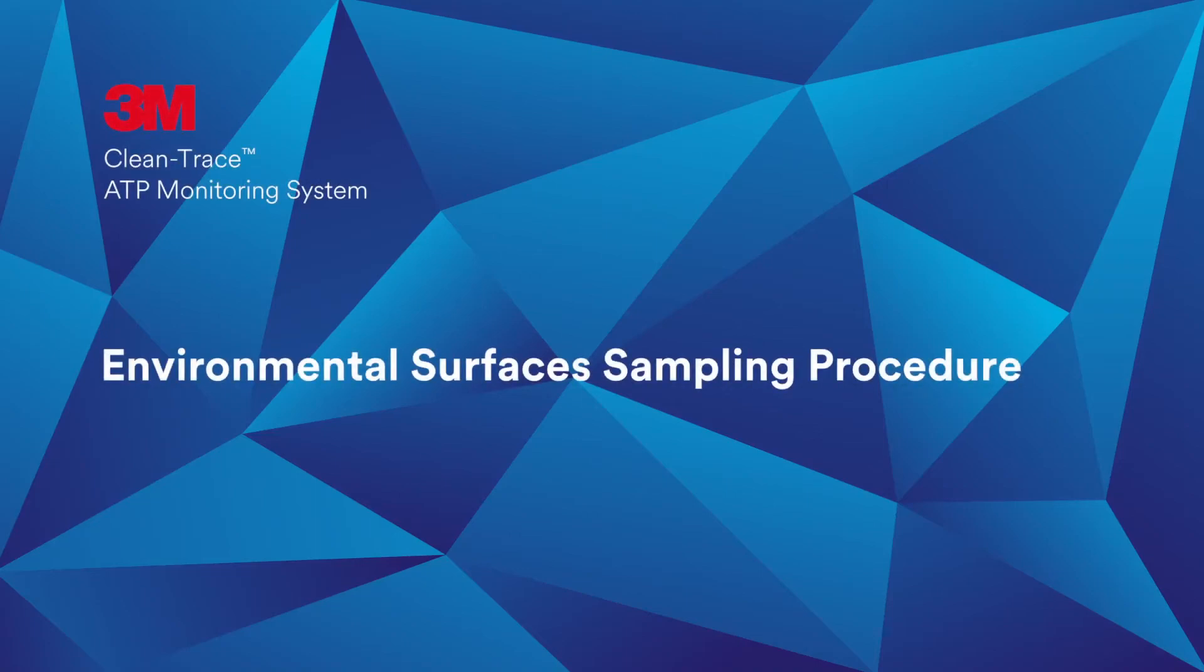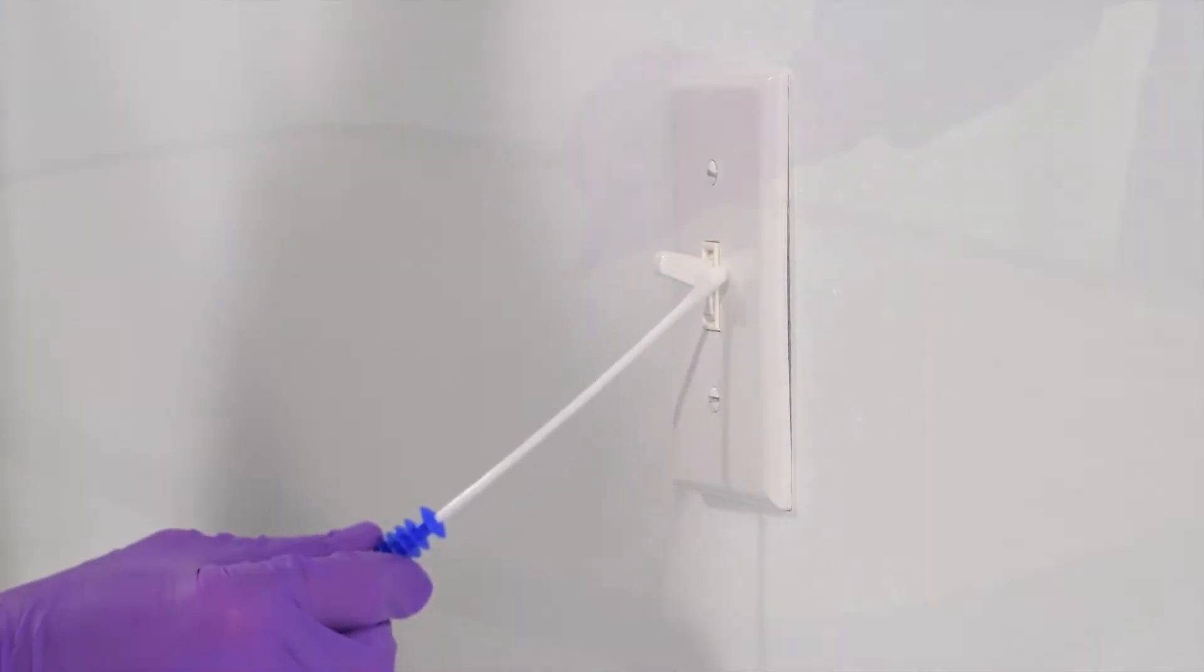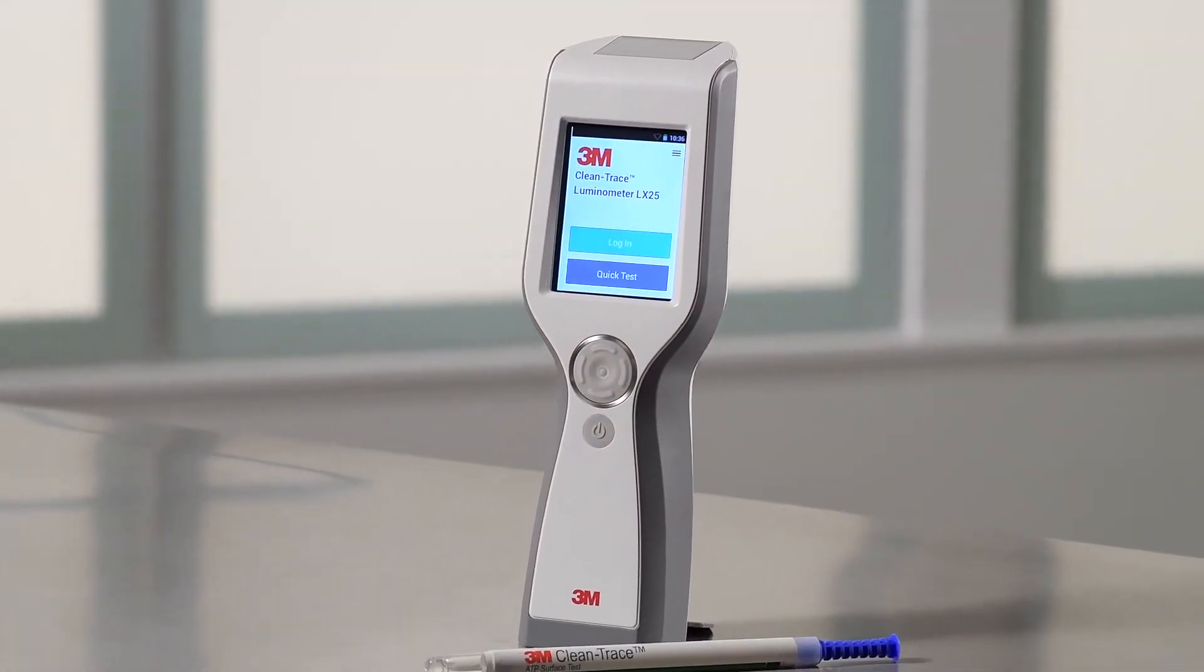Hello and welcome to the 3M Lab. In this video, you will learn how to collect a sample from a high-touch surface to measure cleaning efficacy using the 3M CleanTrace ATP monitoring system.